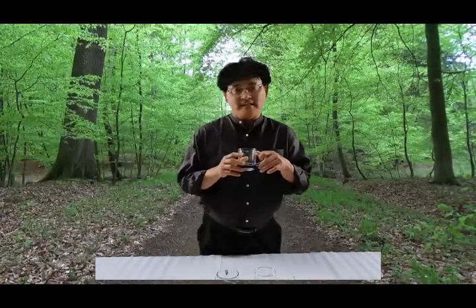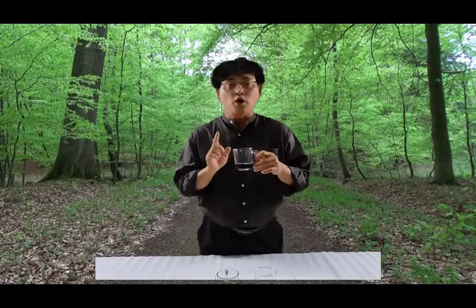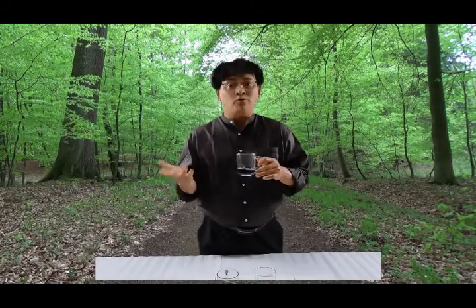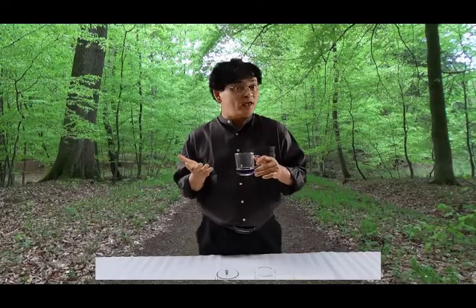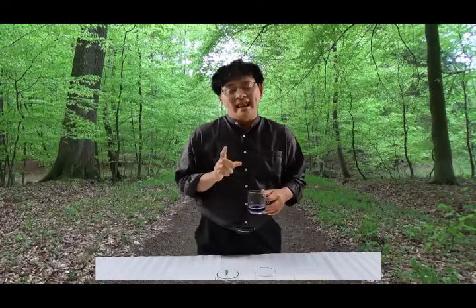The color changes because of the pH value in the blue pea water changing. How do we know and measure the pH value? Let's try this in the lab.